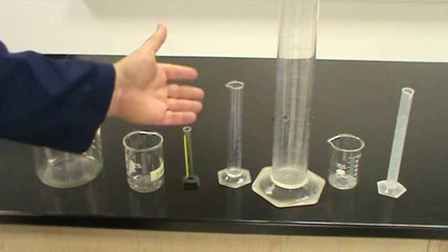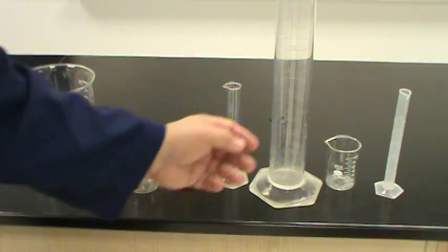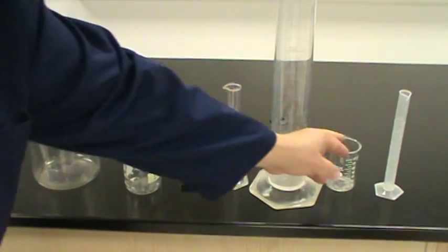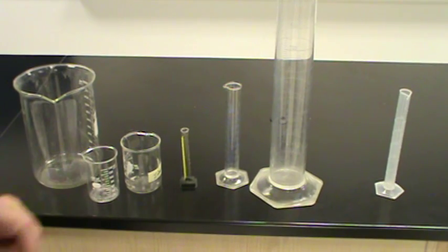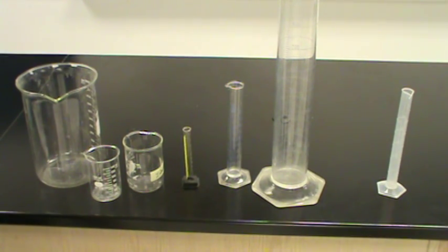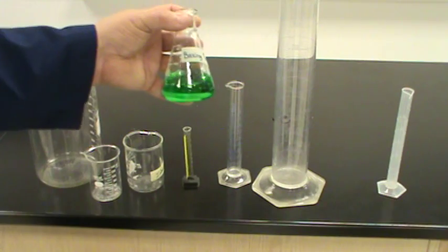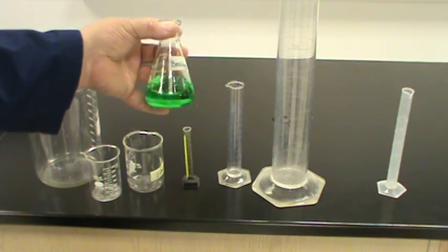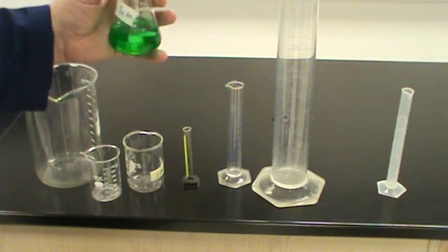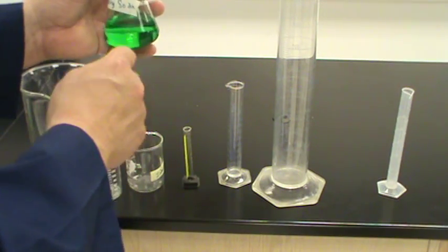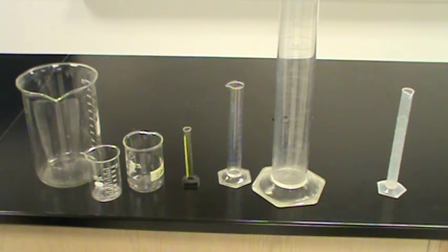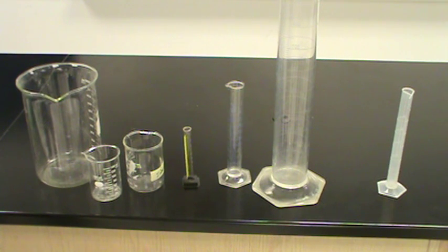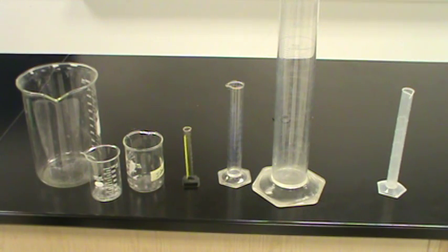We have our graduated cylinders. We have our beakers that are here in various different sizes as you can see, and the other thing that we have but I don't have too many of them out is what we call a flask. In this case this is called a conical flask because it's an inverted cone shape. It looks like an ice cream cone upside down. All of these are used to measure liquids so that we can approximate how much liquid we have to work with for a particular experiment.